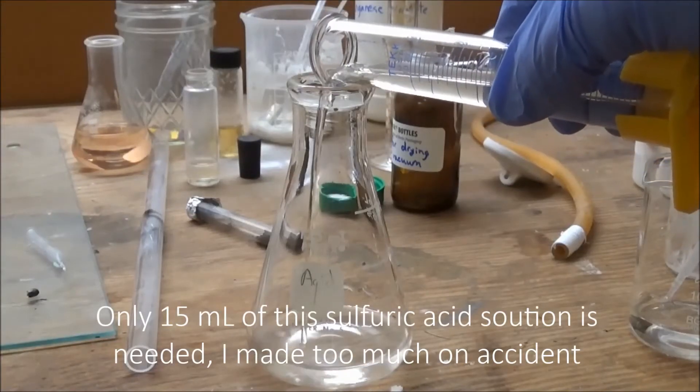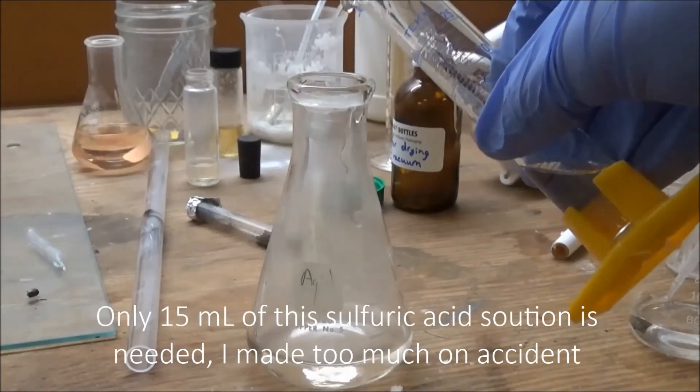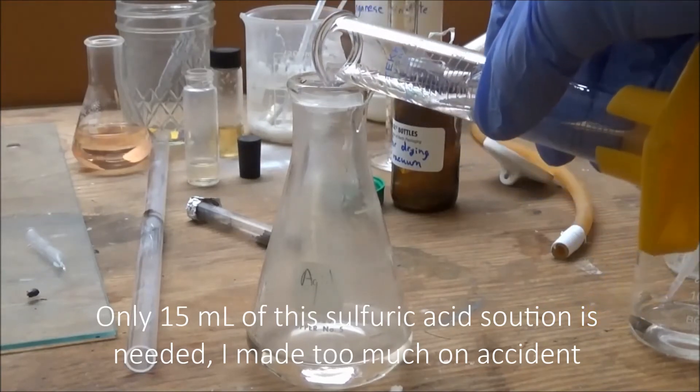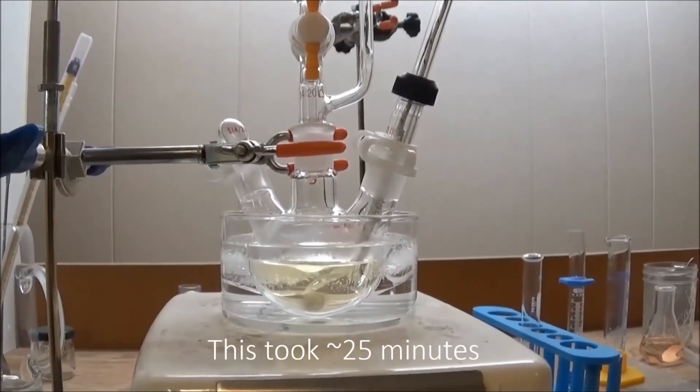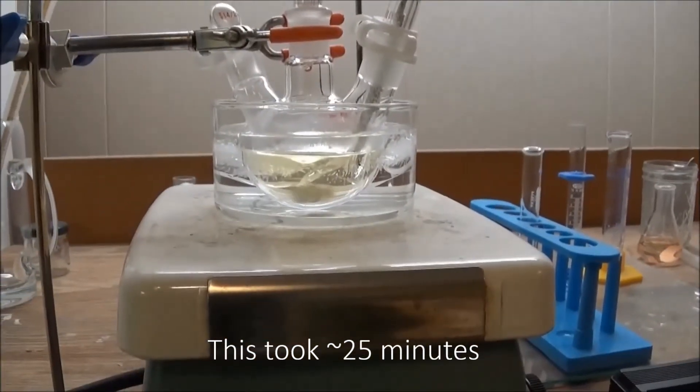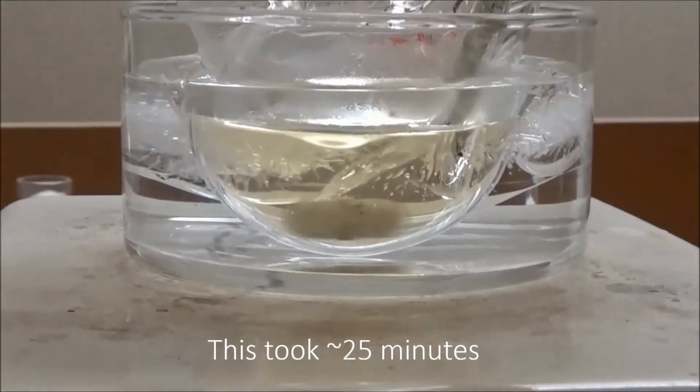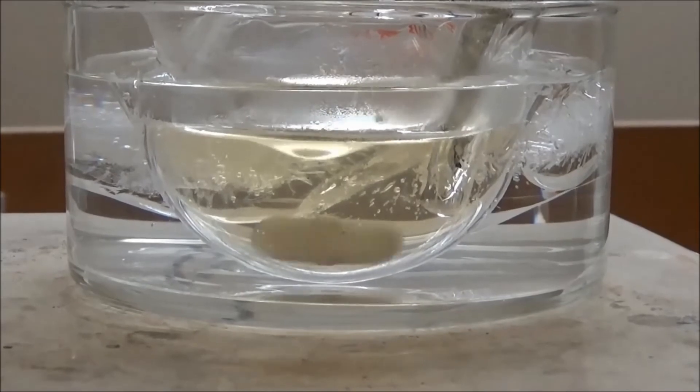While the addition was taking place, I prepared a 50% by volume sulfuric acid solution. Eventually, I added all of the sodium nitrite solution to the flask, and everything dissolved. I then let it stir like this for about 15 minutes.